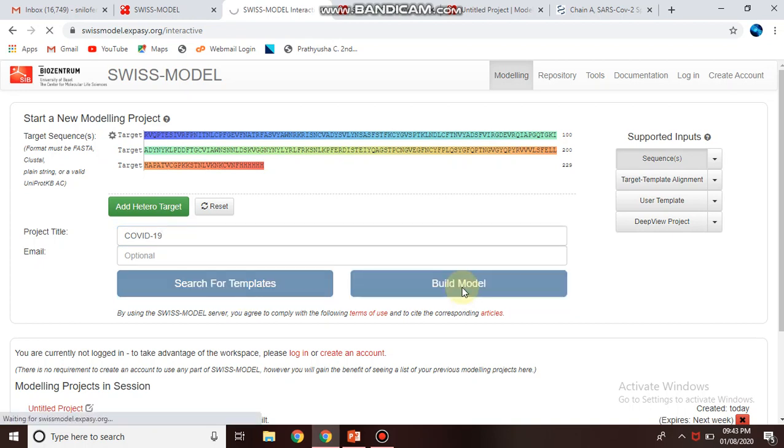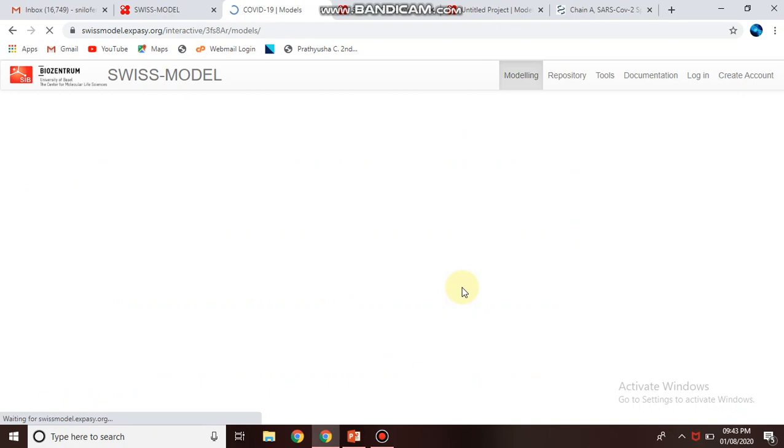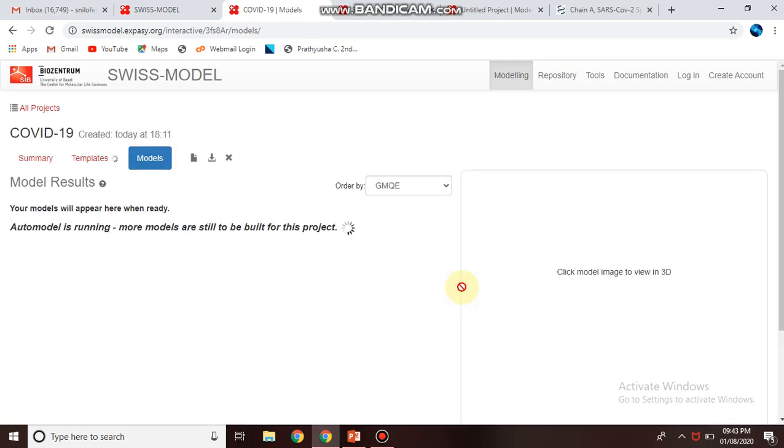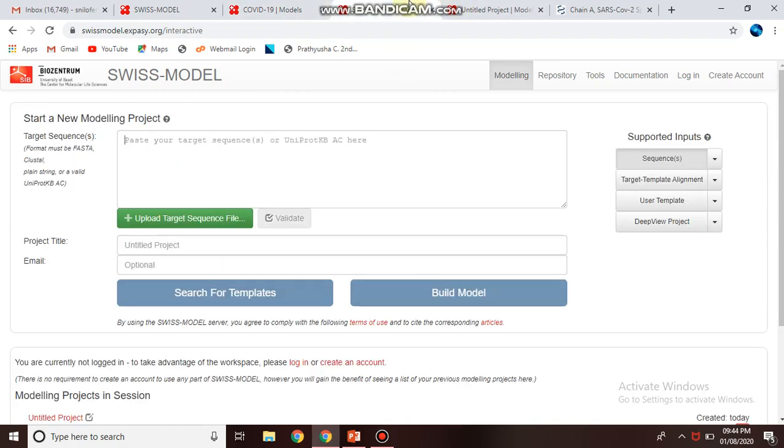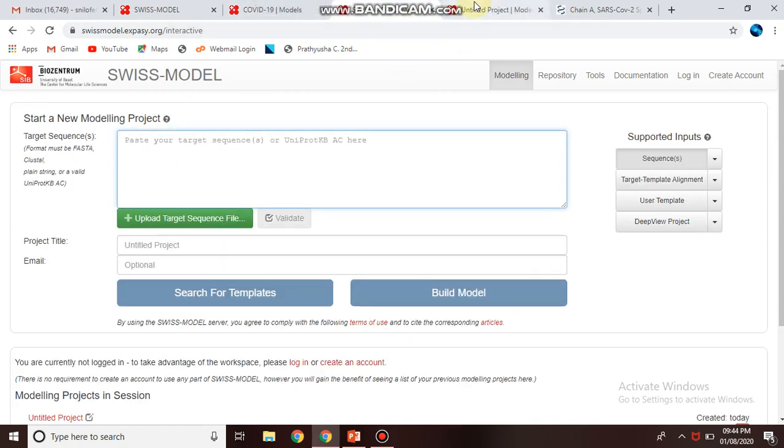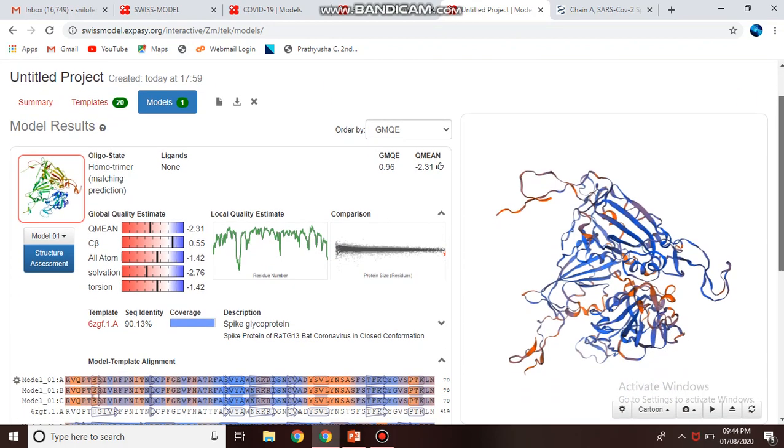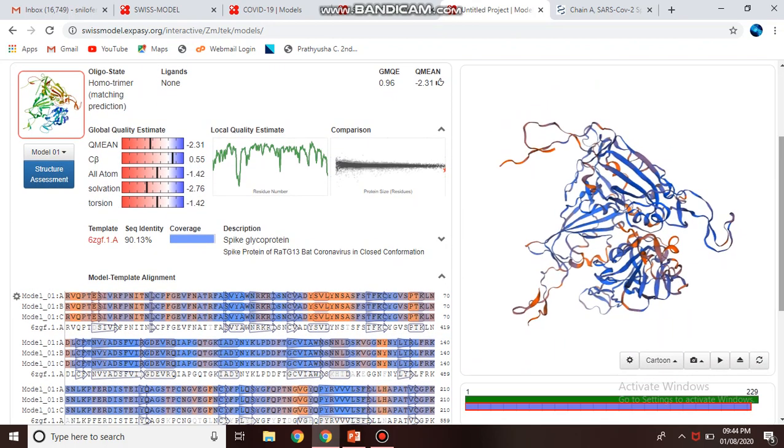These are the steps. This server is a little bit time-consuming. Previously I have done this project. It will generate 20 templates based on the sequence alignment and generate the best three models.